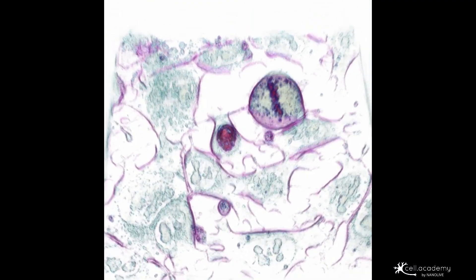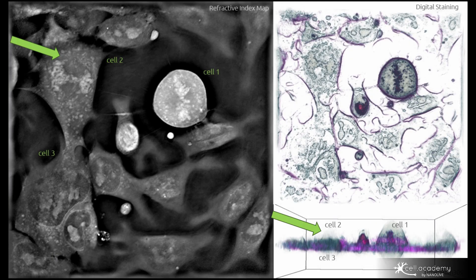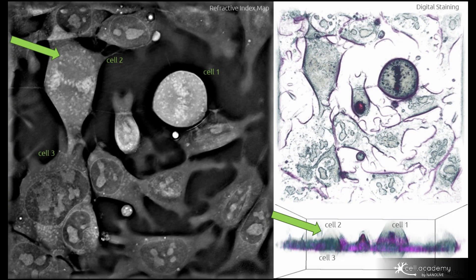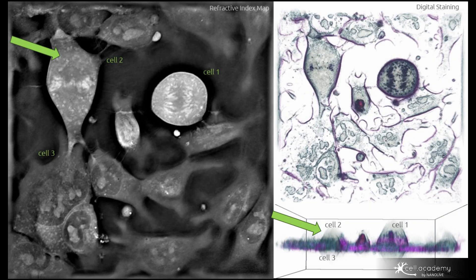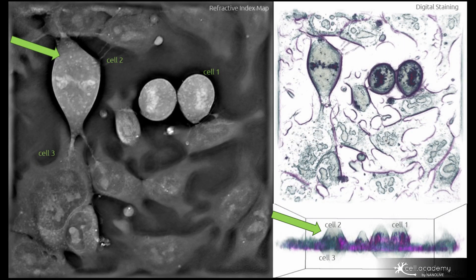Another interesting point to note is the 3D structure of the cells during mitosis. If you rotate the image and look from the side, you may notice that during mitosis the cell forms a spherical structure and then flattens out again after the separation.